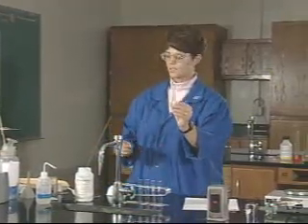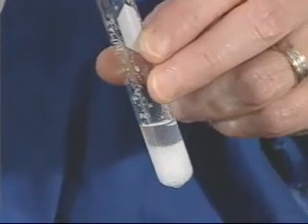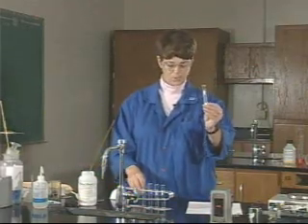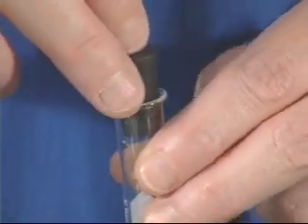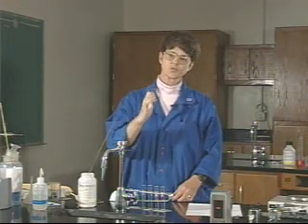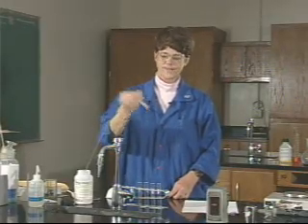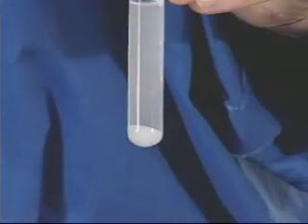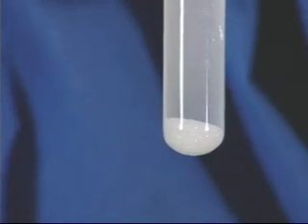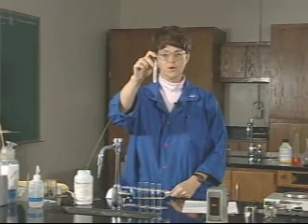Once the sodium chloride has been added to the test tube, we'll use the distilled water in the squirt bottle and fill this tube about half full of distilled water. The next thing we want to do is put a stopper in this tube and shake it very well. Your procedure says to shake this for approximately a minute. What you want to do is shake it, and when you finish shaking it, you want to be sure that there is still some salt that settles down to the bottom. If this happens, then we know that we have what is called a saturated solution.